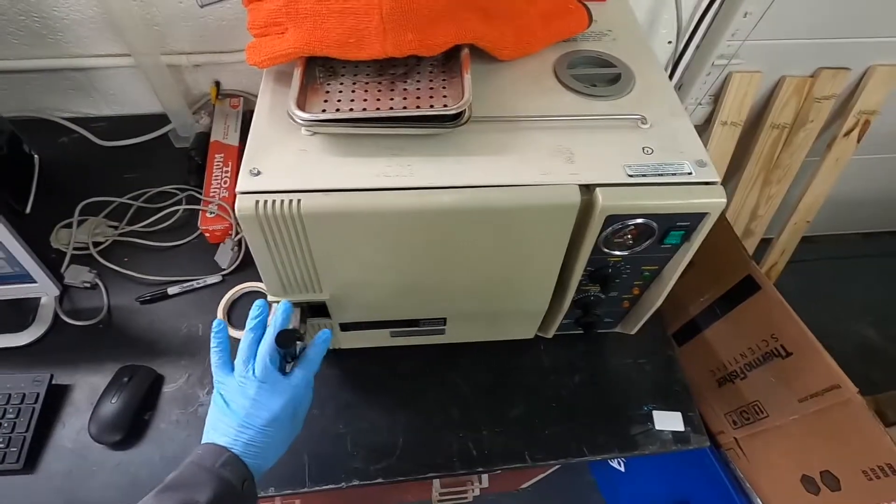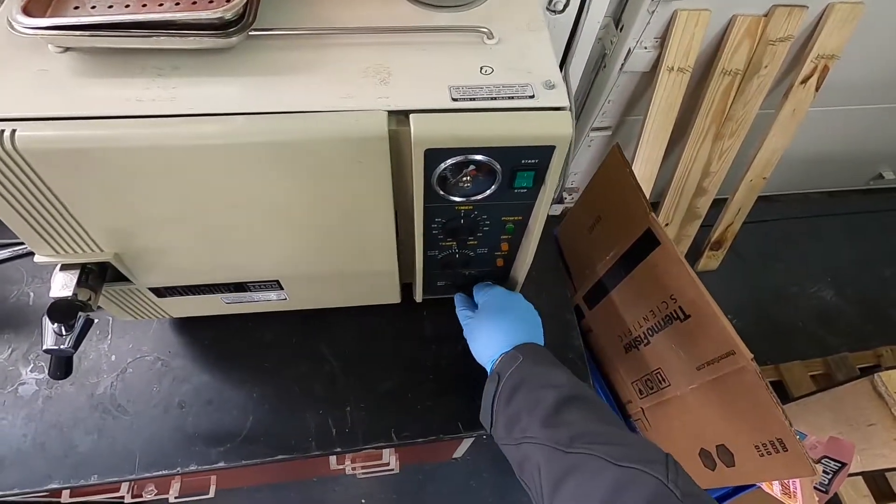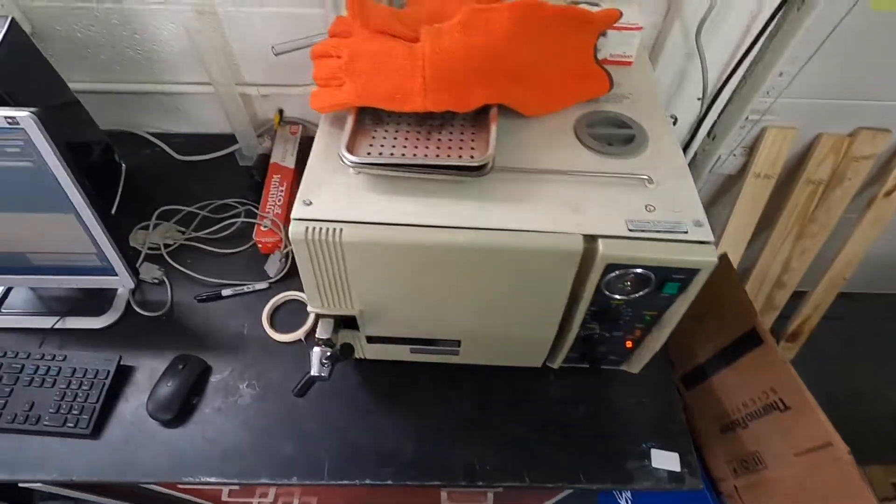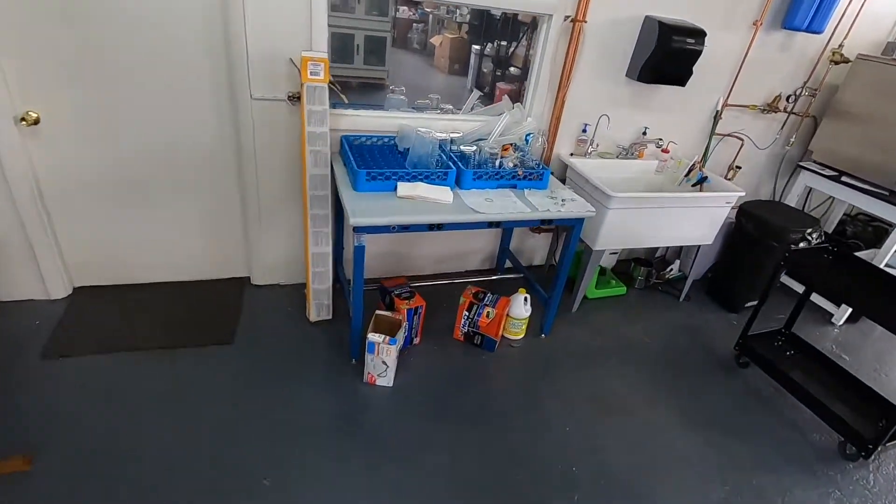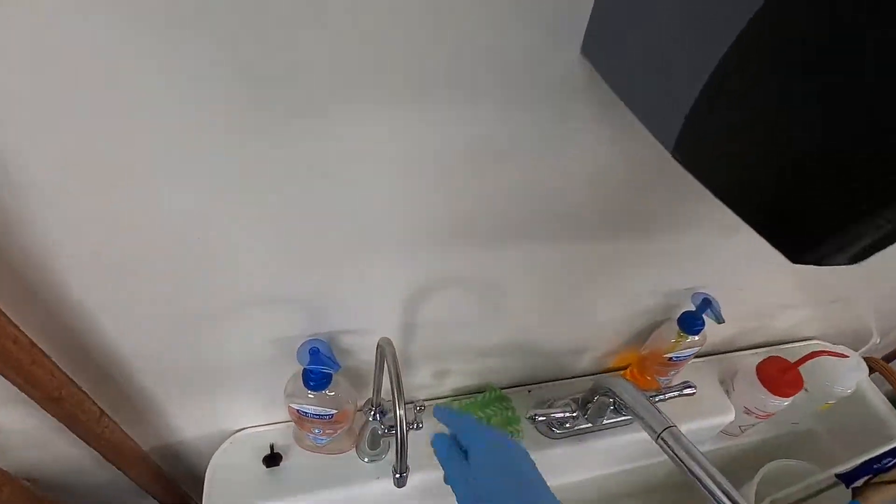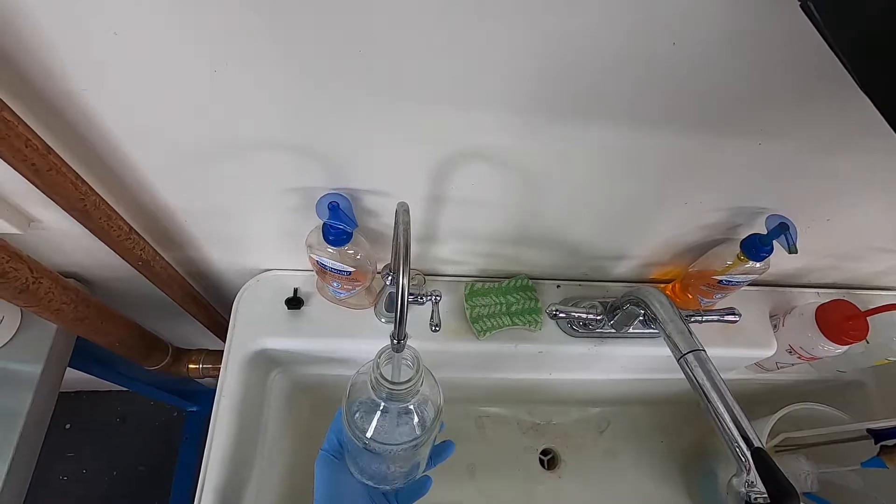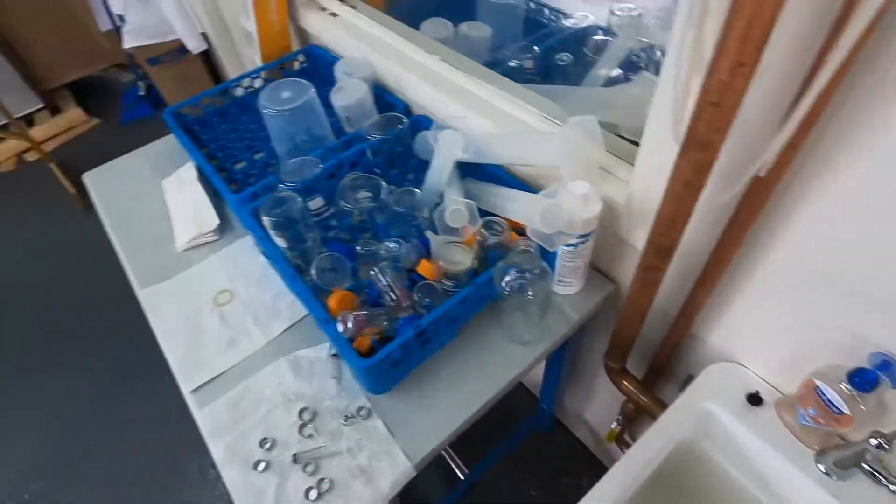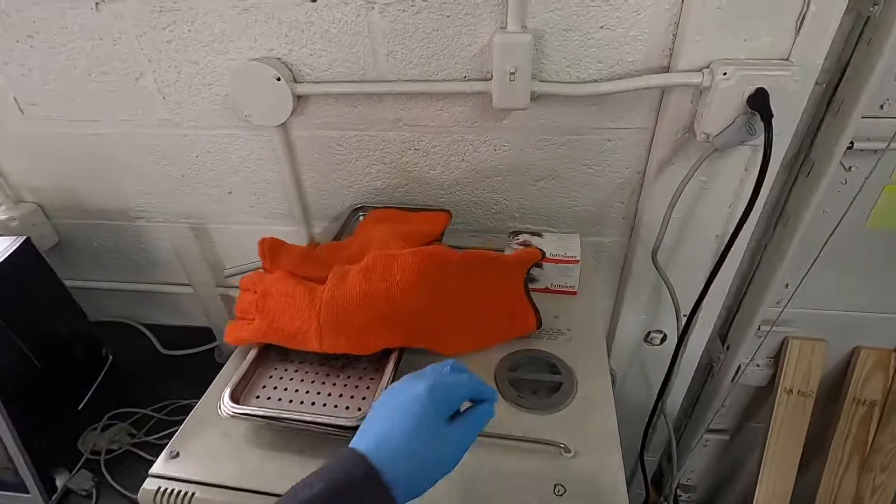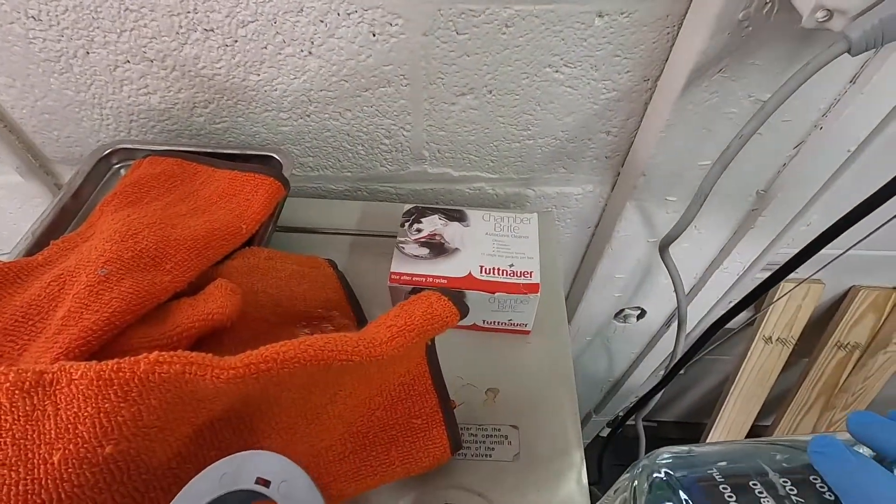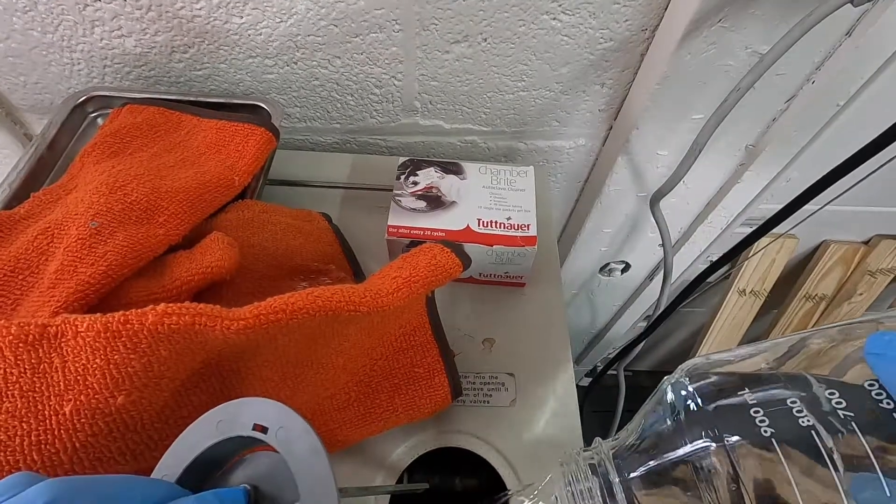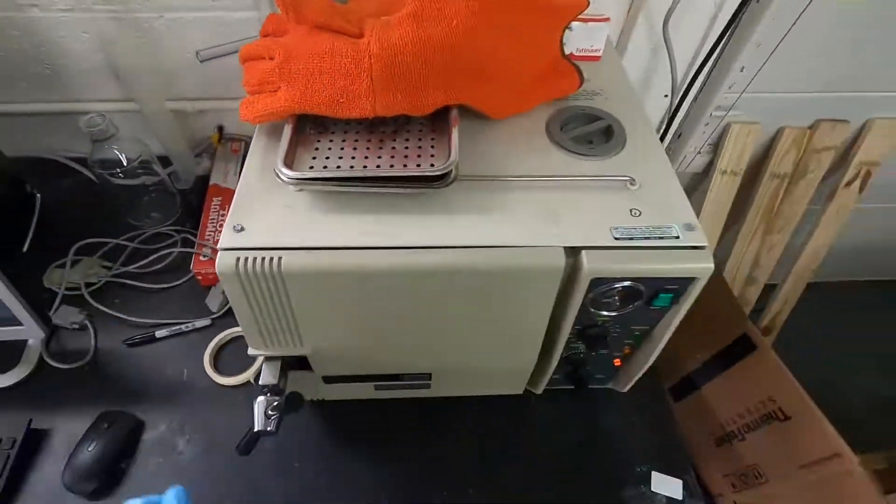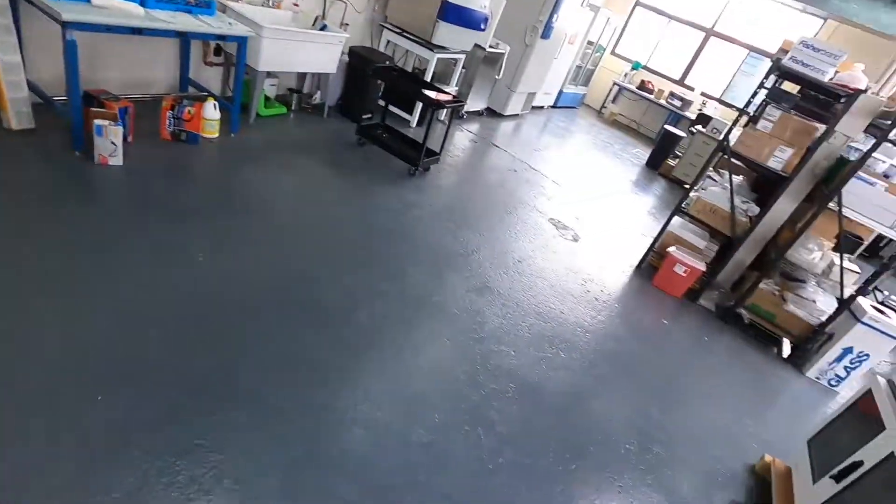So we'll close this. This is set to autoclave. We'll set the timer to 45 minutes. We'll hit start. We reset the pressure gauge. And just to do the right thing, we're gonna fill up some water and put this into the reservoir.